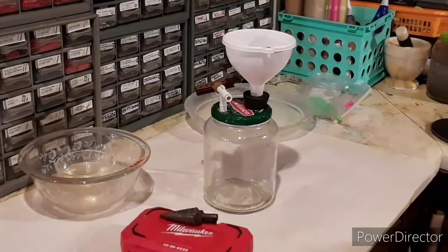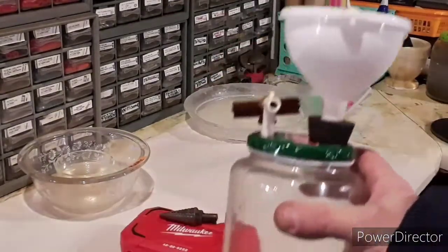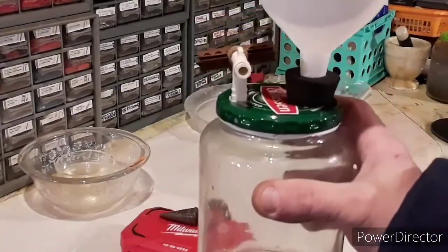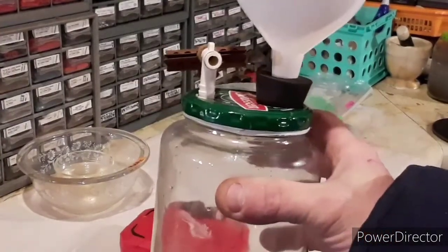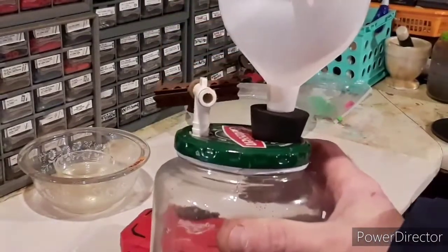Last night late, I was waiting for some stuff to boil off, and I got the idea to make what you're looking at here. What this is, is just a DIY 100% self-contained, all-in-one device — it's got the filter and the catching vessel for vacuum filtration.